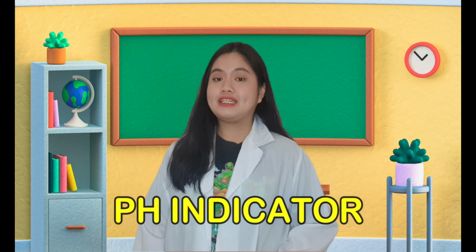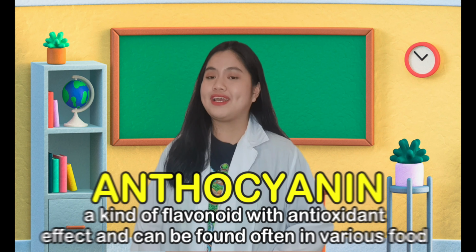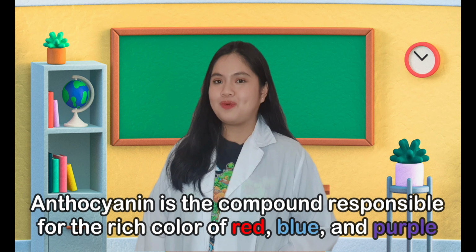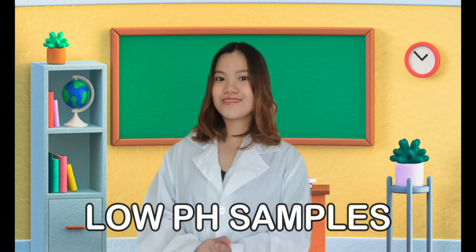You may ask how we determined the pH level of the samples here in our experiment. Well, this happened because of our pH indicator. Included in this indicator are anthocyanins. It is a kind of flavonoid with antioxidant effect and can often be found in various foods including eggplant. This is the compound responsible for the rich colors of red, blue, and purple. So when this anthocyanin reacts with samples at various pH levels, its molecular structure is changed. It is much more stable in low pH samples, resulting in a red color. But when it is mixed with a higher pH level, it creates a color of bluish to purple.